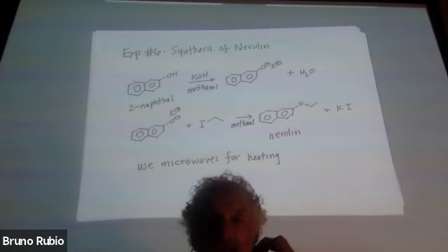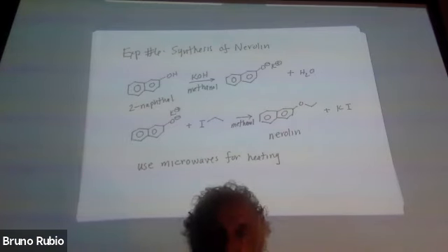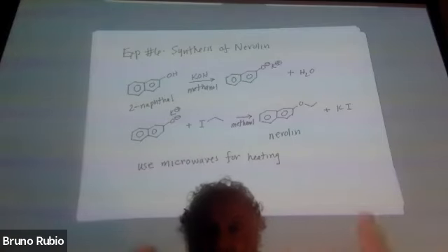So, the same kind of enhancement that we would see in the kitchen is also conferred by microwave heating in the laboratory. Okay, so that's one of the features of this experiment, is that you're using a microwave. And I think maybe the teaching fellows will show you a picture of the microwave and maybe describe how it works. Okay, so that's one of the practicalities of this experiment, is that we're using microwaves instead of conventional heating.